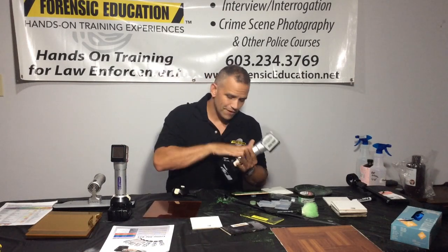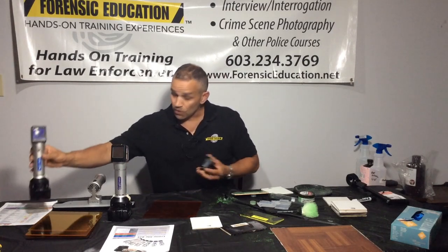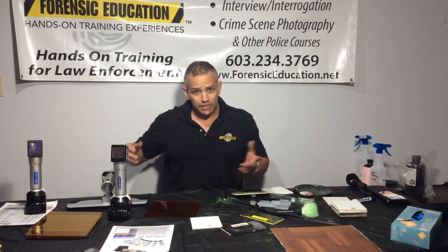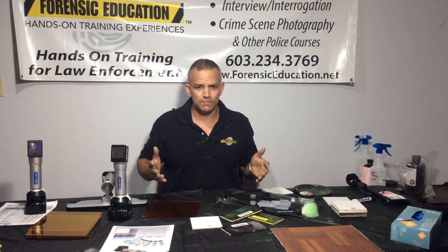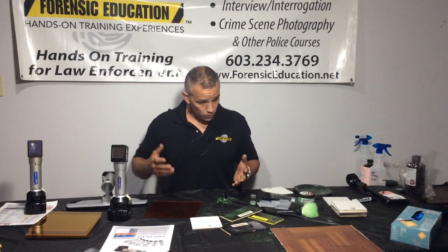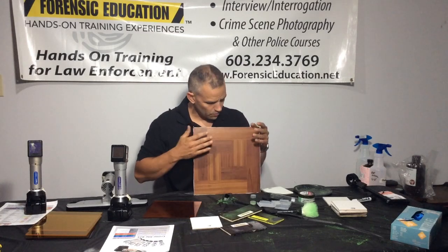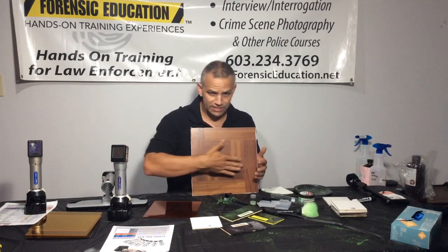Now we're going to get to one of my favorite lights and pieces of equipment. If you've watched any of my other videos, you know I really enjoy footwear. I think footwear is absolutely amazing because most criminals don't change their shoes, and it's something you can tie a suspect to your scene long after the crime has been committed — you can even connect different crime scenes. One of the things we teach is using oblique lighting. I have my tile here with a foot impression on it that you probably can't see until I shine a light across it.